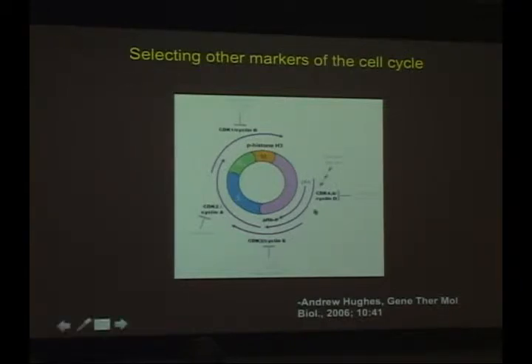And so you can see in this schematic of the basic cell cycle, just about everything here is potentially a target. So we have antibodies to phosphorylated RB. You can get cyclin and CDK antibodies, as well as antibodies to phosphorylated histone H3. And so we explored a variety of these targets to see which of these might function well to define the other phases of the cell cycle.